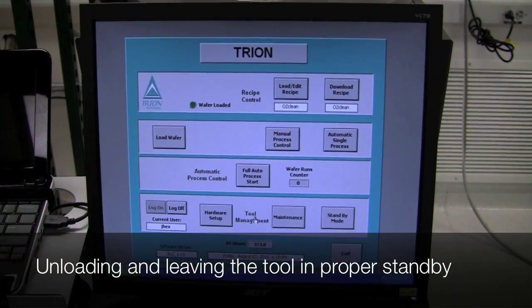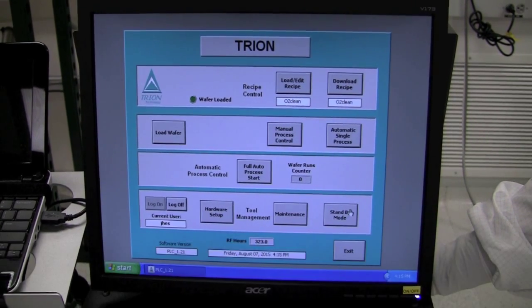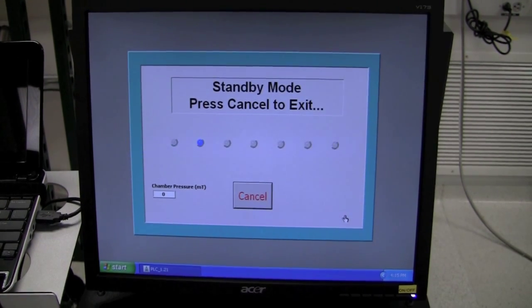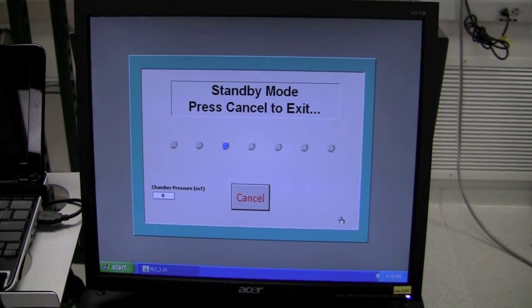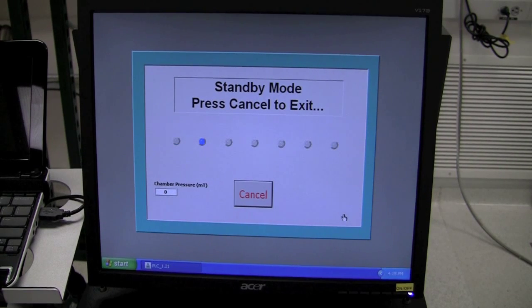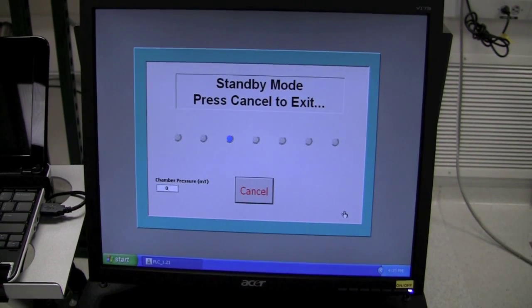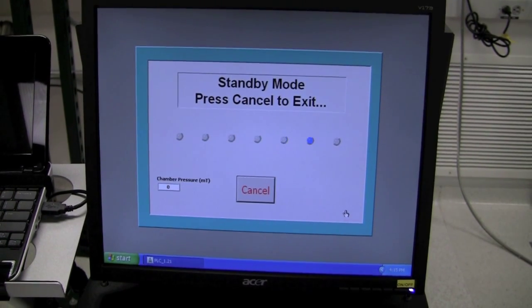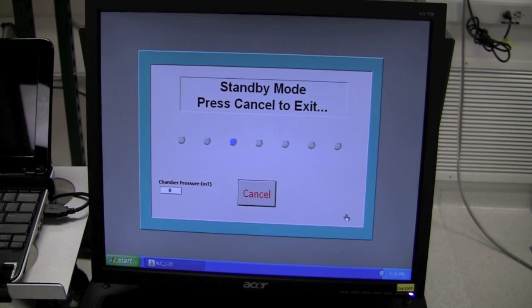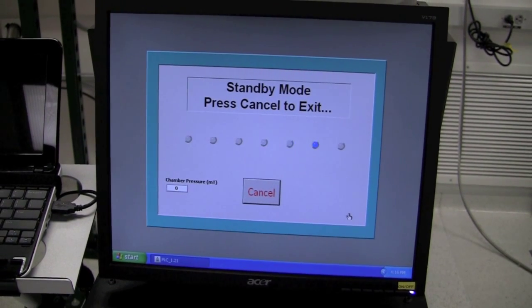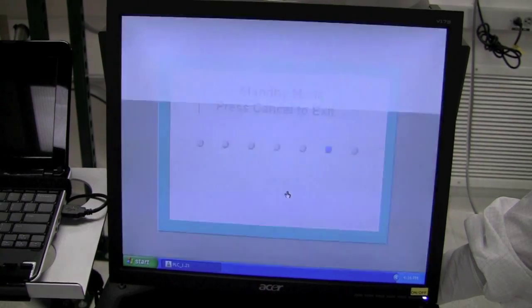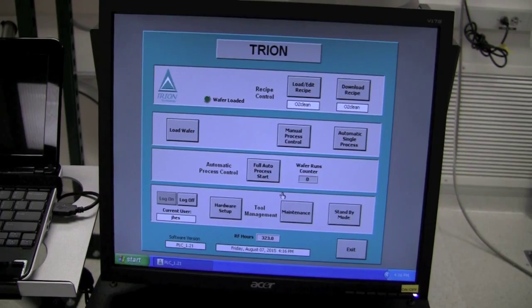Once we've finished processing our wafer, it is now time to leave it in a standby mode. To go to standby mode, we click on the standby mode button. This will pump down our load lock to a near vacuum level, especially if you did not pump it down earlier. So, if you vented your load lock earlier and forgot to pump it down, it will pump down at this stage. So, now we're in standby mode and we're not done yet. We actually have to do one more step. You see, if we leave it in this mode, the pump will keep pumping on the chamber until it reaches an equilibrium point. At this equilibrium point, oil from the pump can actually creep back into the load lock and deposit on the walls. This is bad because the oil can interfere with your etch rates. It can cause contaminate and cause a lot of weird effects to happen. So, to prevent this, we want to shut off the pump in a way that leaves the chamber under vacuum. So, to do this, we will cancel out of standby mode and then cancel out the ventilation because when you do this, it tries to vent. And I'll show you in a second what I mean by that. So, we had a venting load lock notification. We canceled immediately right away. And now we're left with a nice chamber that's under vacuum and the pump is no longer pumping.